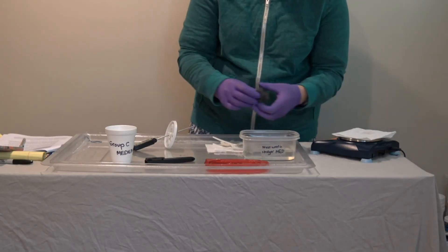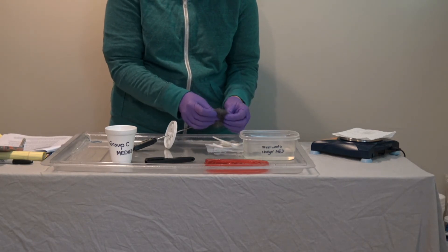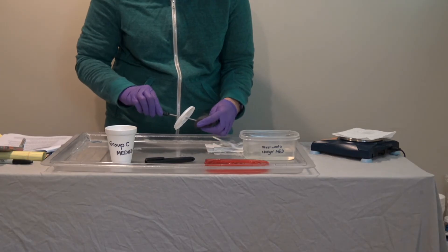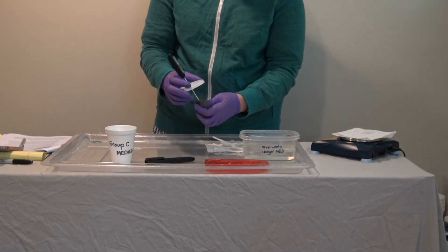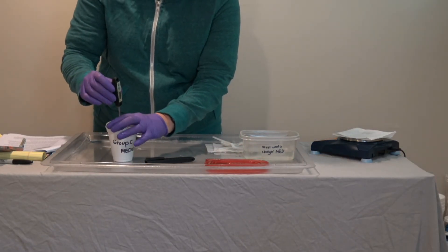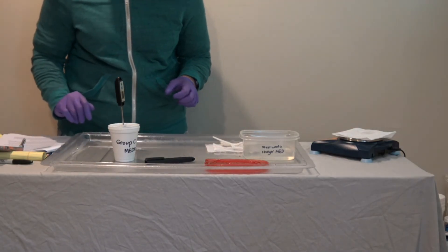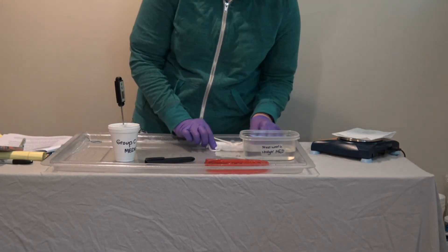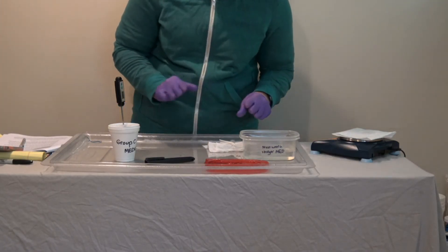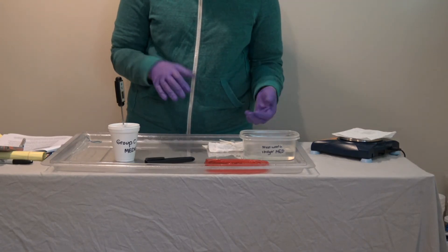Next, using gloved hands, stretch out that piece of steel wool, then place it around the digital thermometer, close that into the styrofoam cup, and start timing. Students can then read the temperature changes every 30 seconds for five minutes.